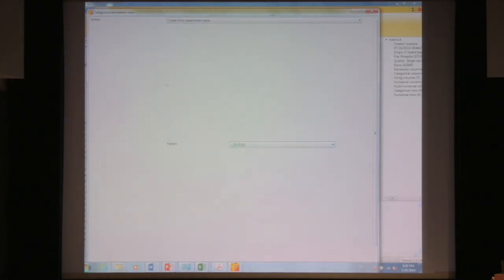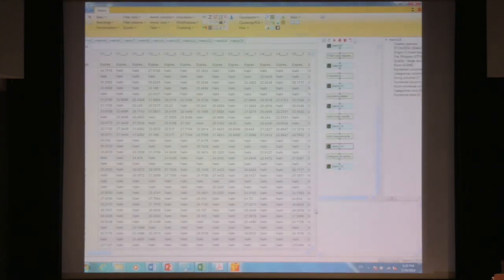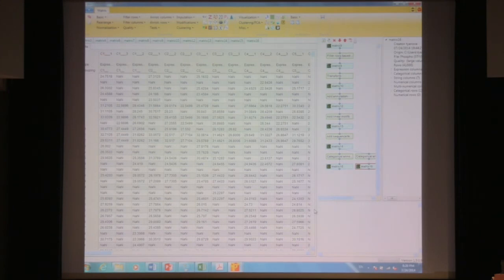So I'll just show you some other ways we could do that. Nope. It's not going to work anymore.